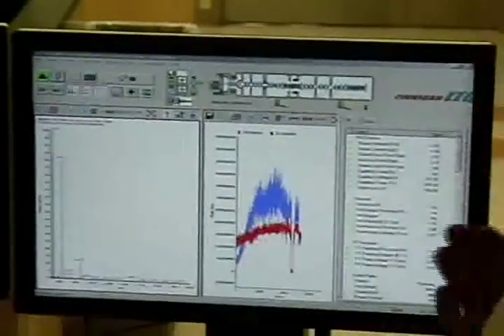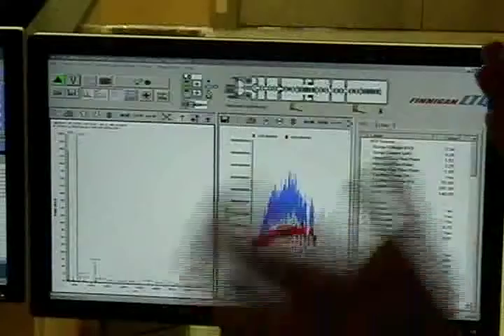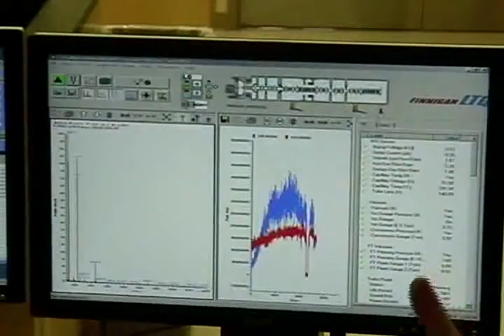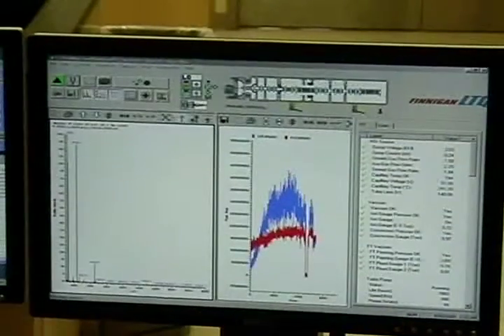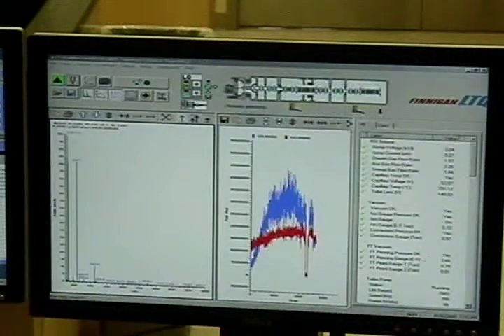On a quad, that height, since it's a real ion measurement, you can see it go up or down. On ours, since we got 30,000 ions always, is it the fact that I converted to something different, or am I making less of it? And you can't tell with the trap. It's kind of one of the little screwy trap things.